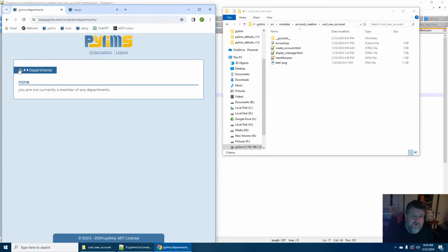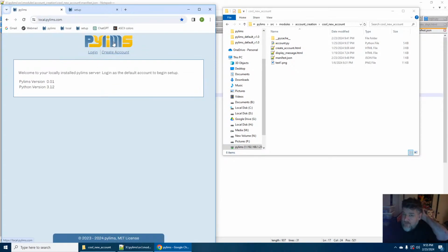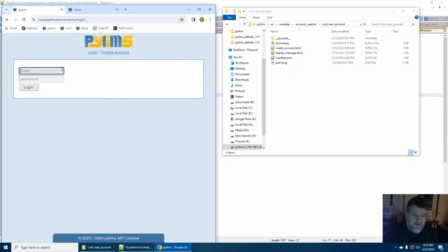That's very weird. The organizations is broken. Did I click something? The organizations mod itself seems to be broken. Oh, because I'm logged in as some random user and I haven't done that in a while. So let me actually log back into my root account.